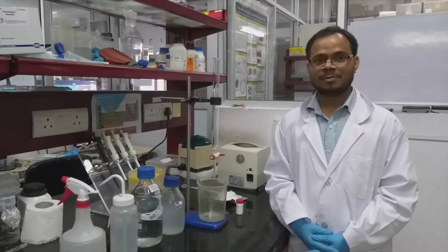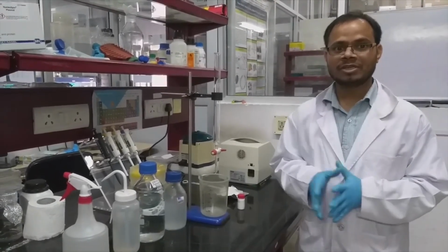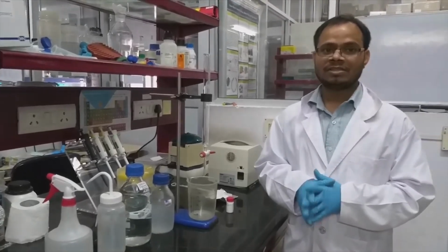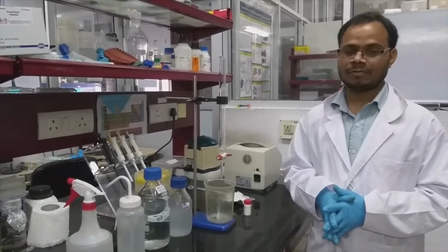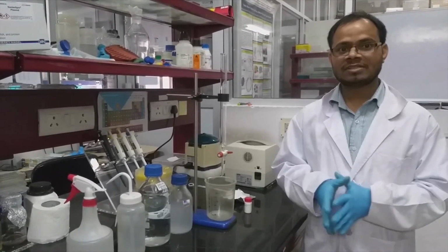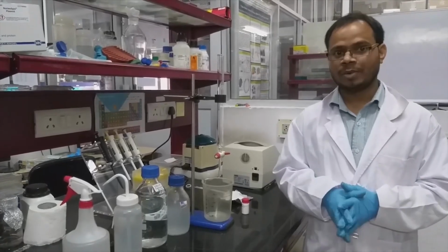Hi everyone, myself Swayam Prabha, Research Scholar at the Department of Biosciences and Bioengineering at IIT Bombay. In this video, we will demonstrate how to perform gel filtration chromatography or size exclusion chromatography. There are various methods available in chromatography to separate different types of biomolecules.